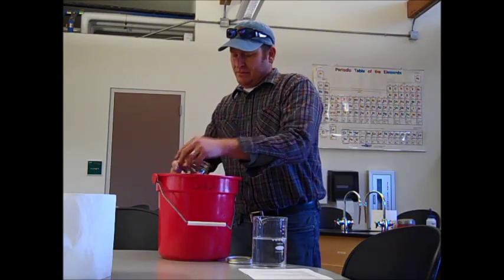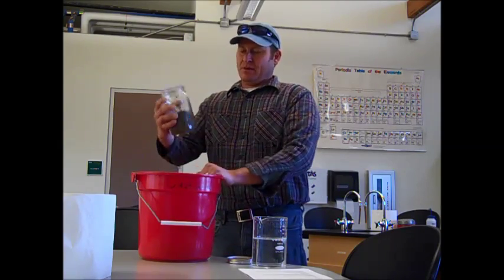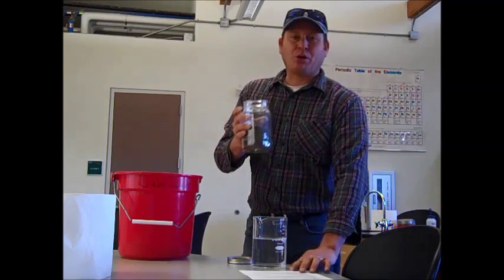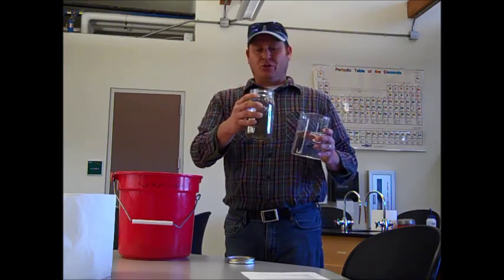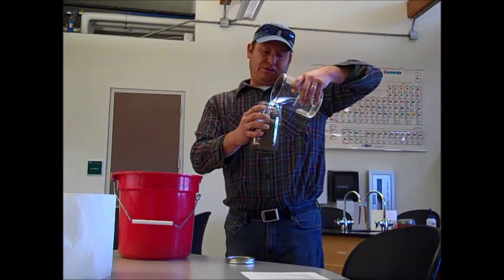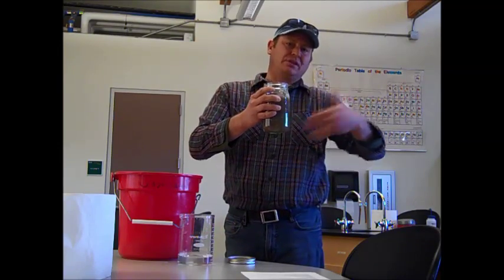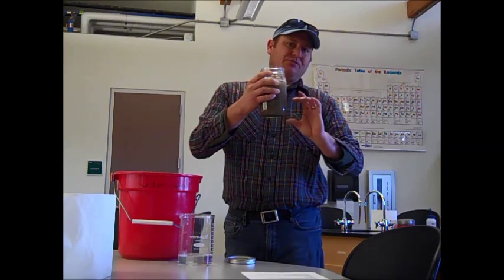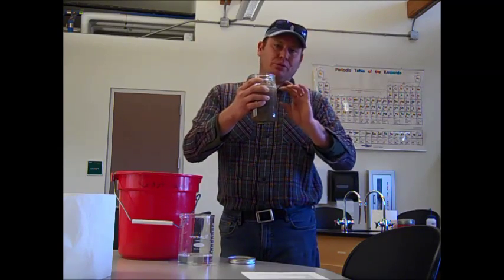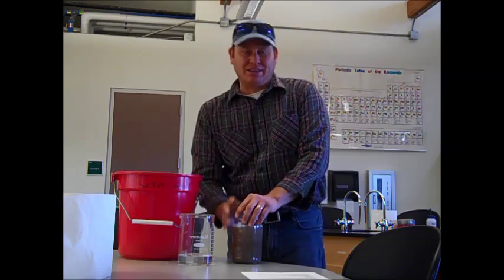I'll add about 50% of the soil here. I'm using about this much. This part is not critical for the measurement. And then I need enough water to put this into suspension. So I'll probably add water until about there. It gives me enough water space to get this agitated and stirred up. Again, I didn't measure that. I don't care on this part, sedimentation. We're just going to measure the depth of the different soil separates, and we're going to ignore the water that's in there. So again, just enough water to get this thing violently stirred up.